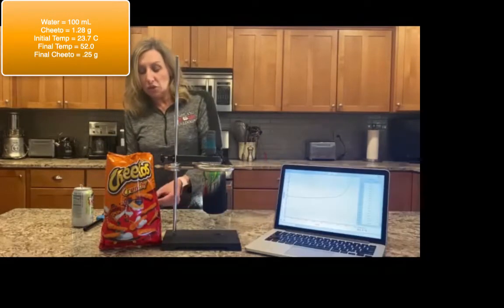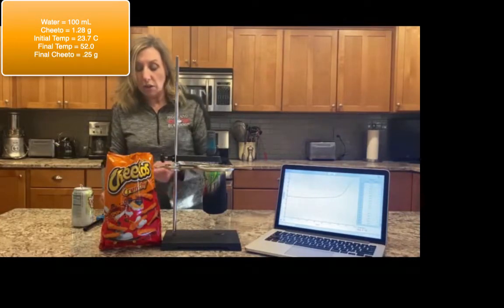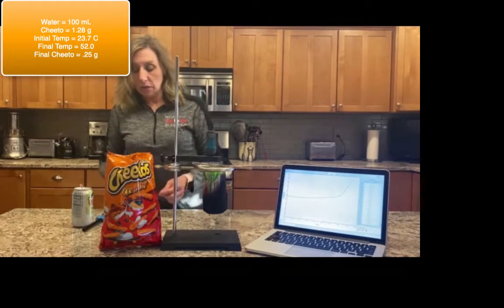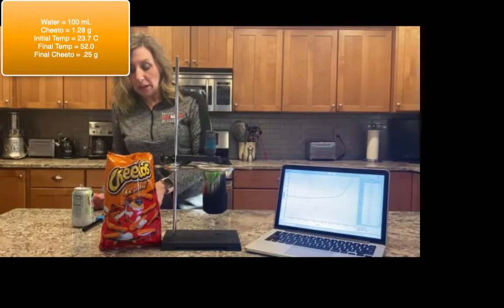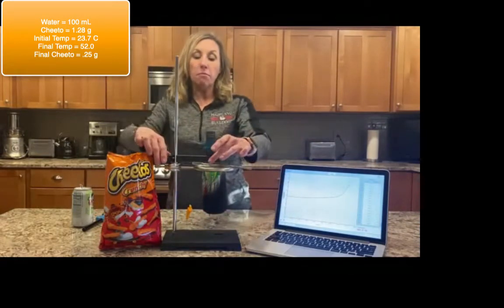Okay, then I'm going to take this Cheeto off and put it on the scale over here and subtract out. There's 0.25 Cheeto left. So my initial weight was 1.28, final weight was 0.25. Okay, now we're going to do this a second time.